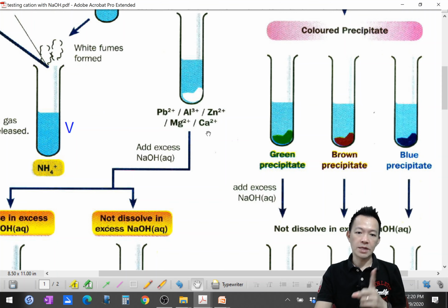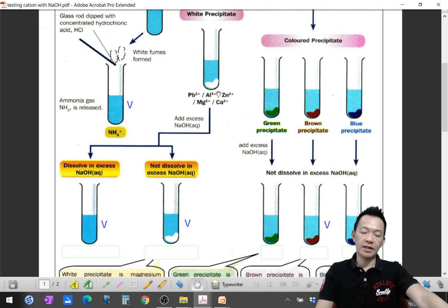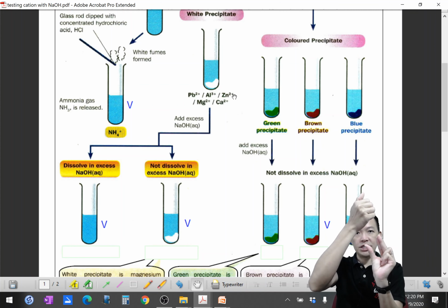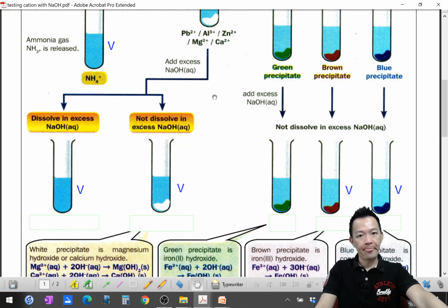你马上看到白色的粉跑出来. So calcium, magnesium, aluminium, lead and zinc, 这5大可能性. Okay? And now, after you see the white color precipitate, 当你看到了白色的 precipitate 过后, you add the sodium hydroxide solution in excess, 你加多多的 sodium hydroxide. Okay, and after you add the excess of sodium hydroxide, what's going to happen?